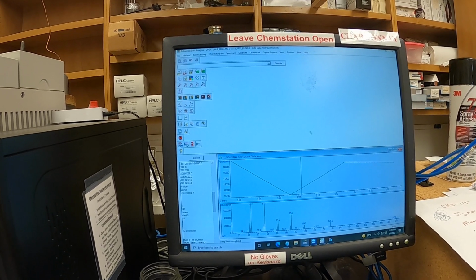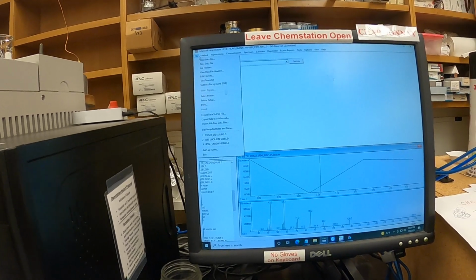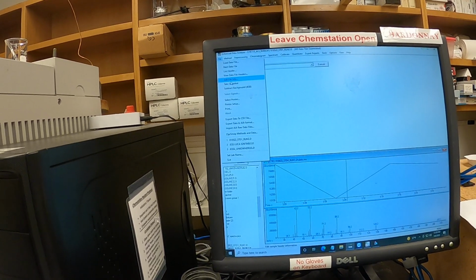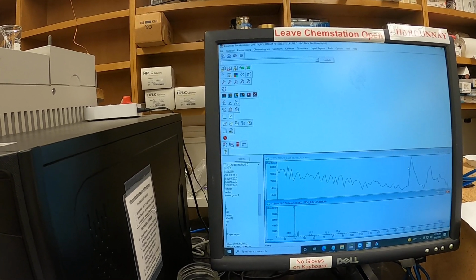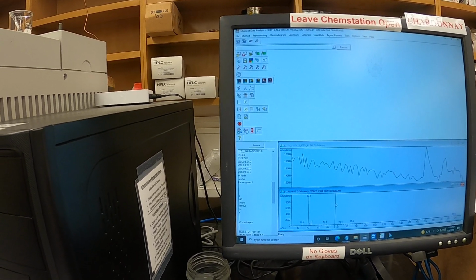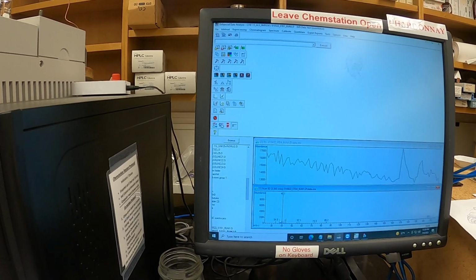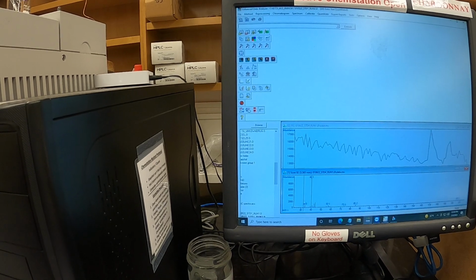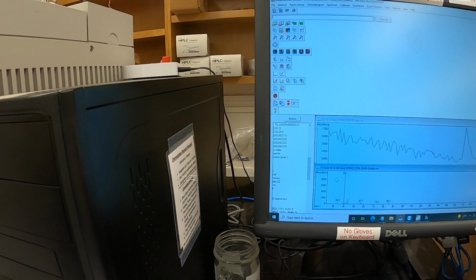Oh, what happened? You saw it. I have it documented. This thing just got corrupted. And so I just double right click in that, and hey, it's saying, well, not much, right? Propane, I doubt that. I don't like scanning below 33 is usually where we set it. Sometimes it's 50. So I'm surprised that we're actually getting this stuff.